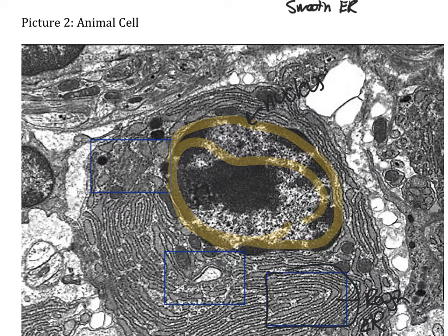That looks pretty obvious. The nucleolus, in the diagram I got this from, says that's the nucleolus. Again, an actual picture is going to be a bit more clear.